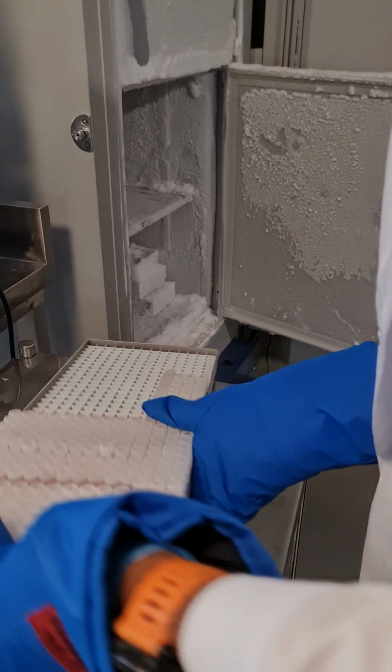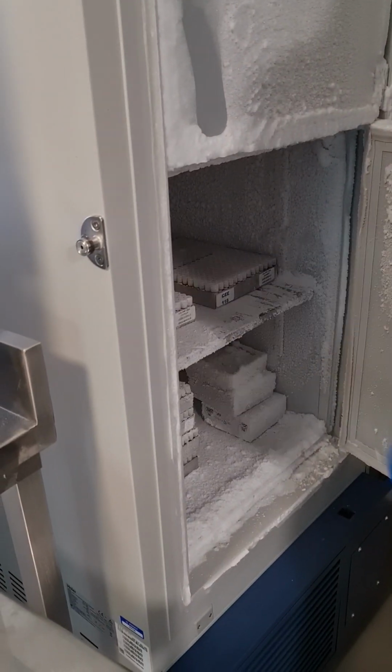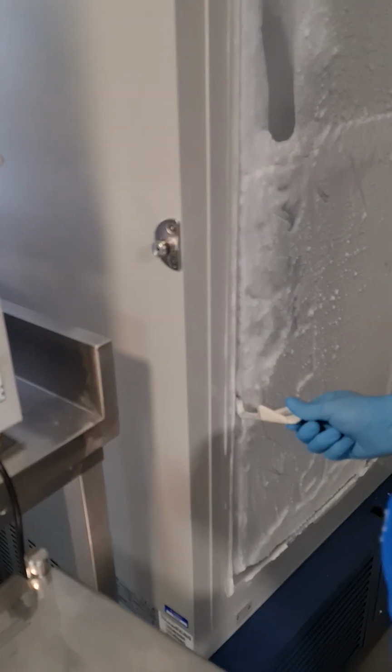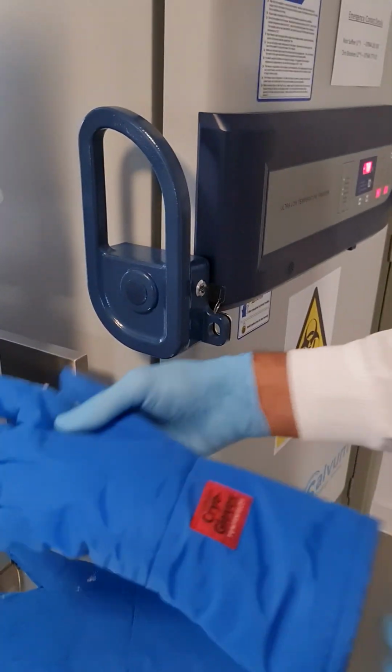Once again, safety first, blue gloves, tray goes back, close the freezer. We're done with the sample. Thank you.